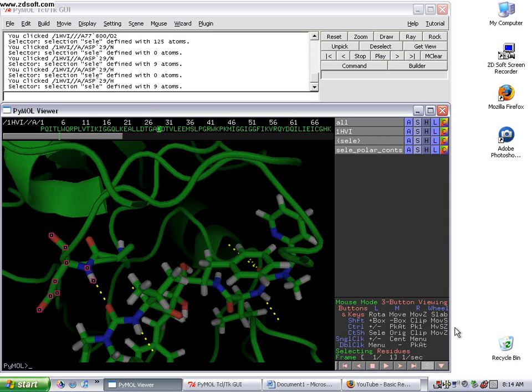All right, welcome to the fourth video in the protein structure tutorial. In this video, we're going to take up where we left off. You'll remember last time we were looking at important protein ligand contacts, and we left off looking at this aspartic acid 29. You'll remember that this was likely a hydrogen bond between the NH2 group, the amino group, and this oxygen group on the inhibitor.